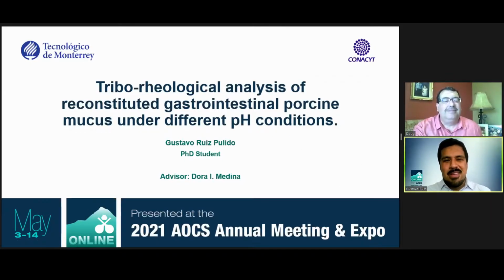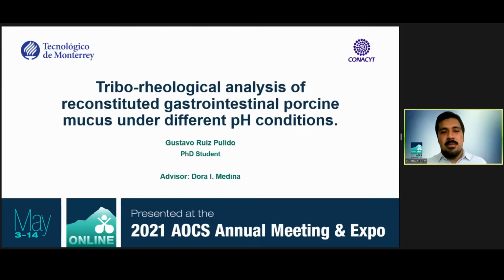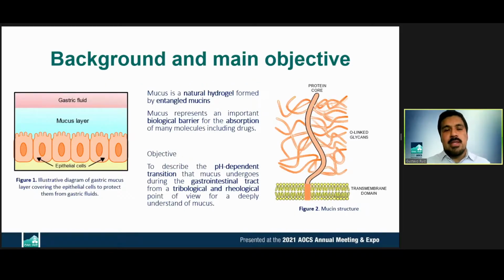Hello, hi everyone. Thank you for joining this presentation. As Doug mentioned, I will talk about the Tribo-rheological analysis of reconstituted gastrointestinal porcine mucus under different pH conditions. It's important to mention first that mucus is a biological barrier that covers every wet epithelial surface in our body, so it's quite important.